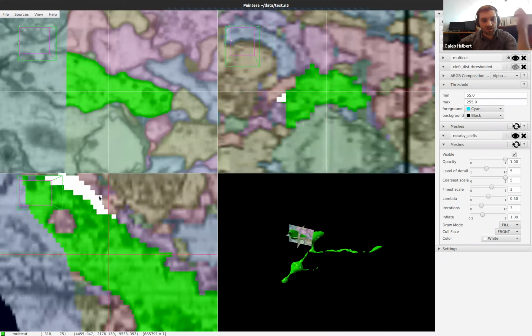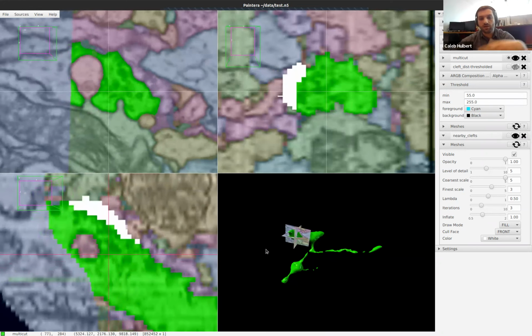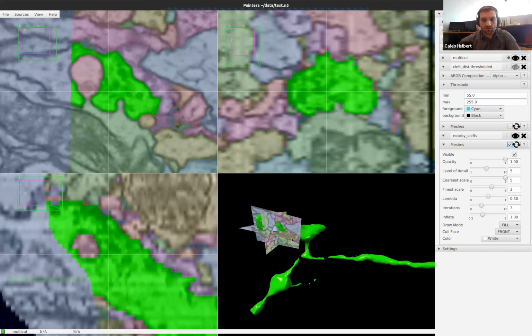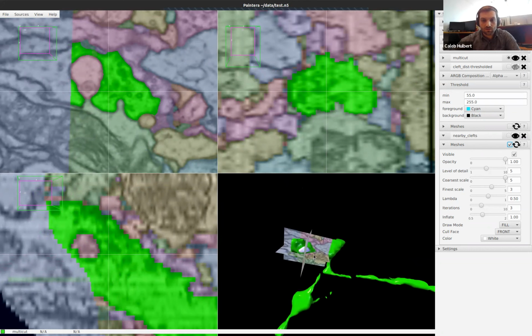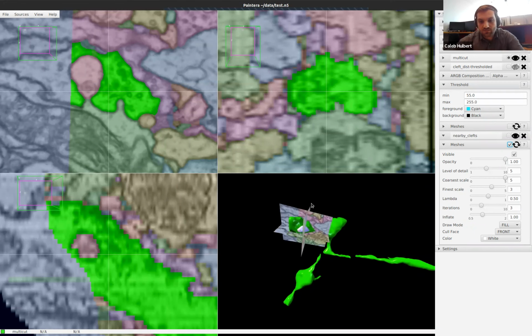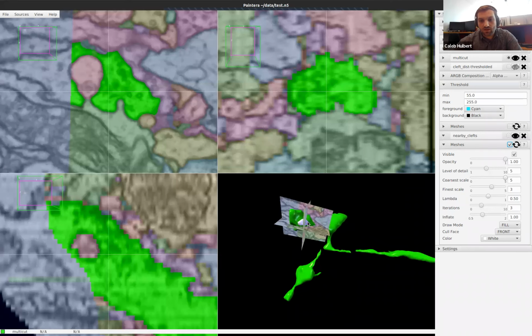Yeah, so okay, you can see it starting to populate, right? Here you can see it detects the clefts that are nearby, that are connected to this, and it'll go through and connect all of them. So if we turn on the meshes for this, it'll render them, and we can move in and, oops. So you can start to see, if I can, the clipping plane is acting up a little weird here. But yeah, you can see this white portion of the mesh is rendering.